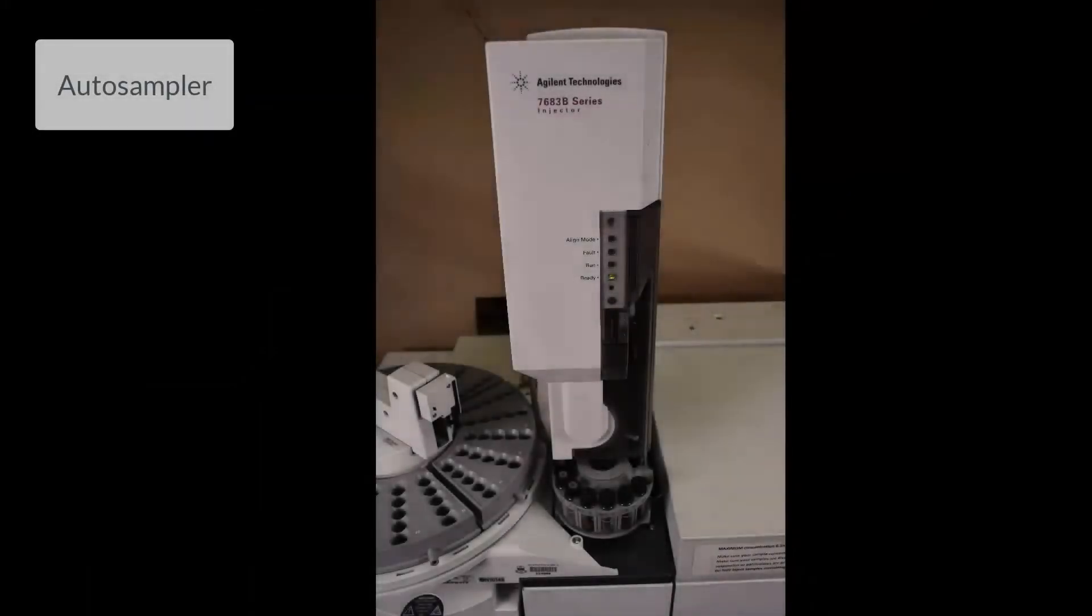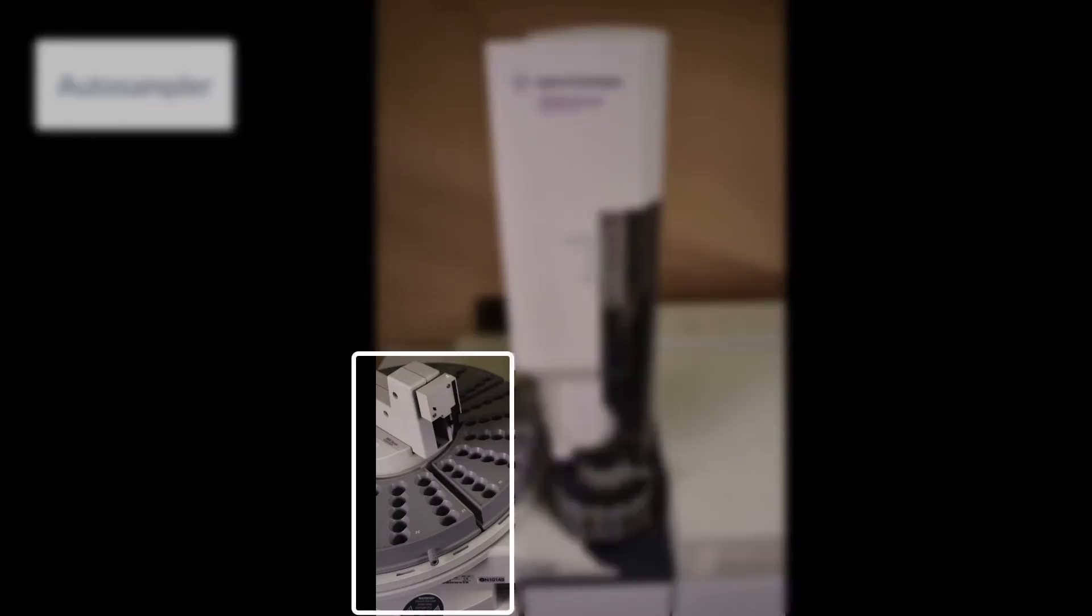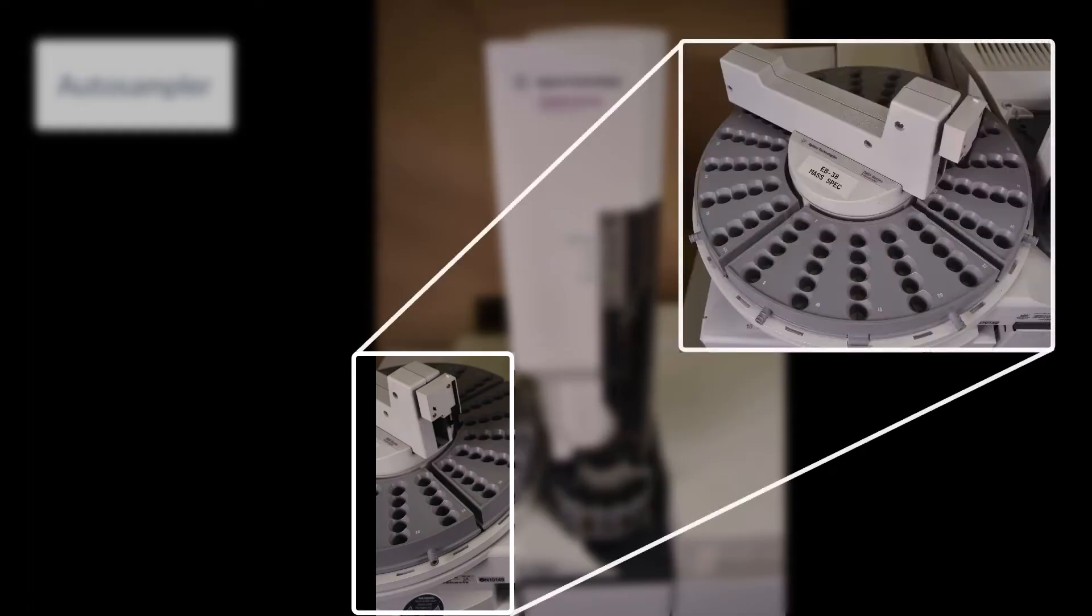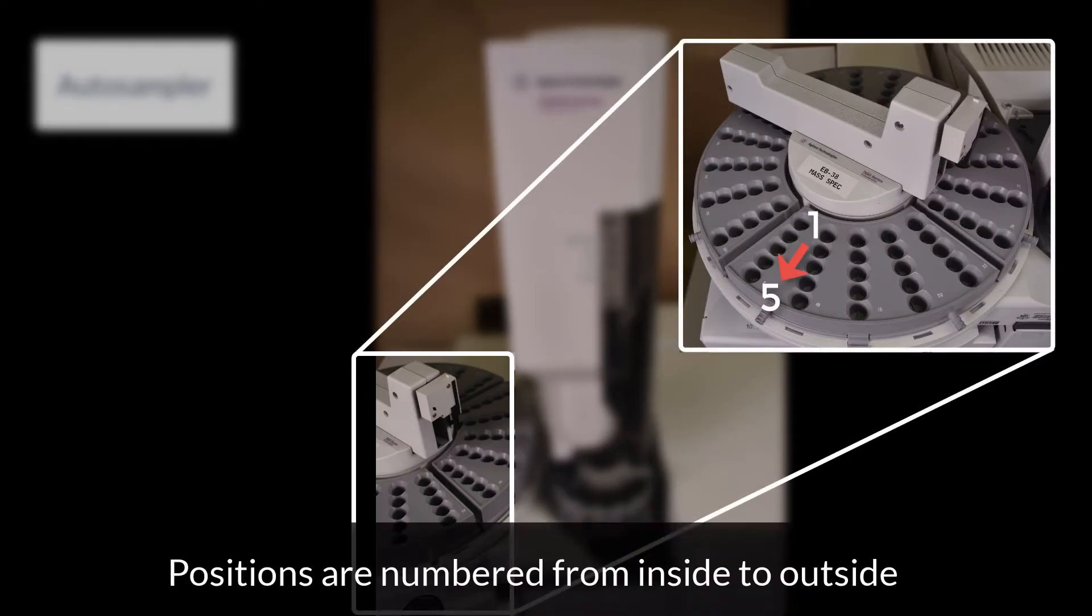The auto-sampler allows for fast sample introduction, as well as multiple injections done by the instrument itself. Here is the sample tray. Note that each position is numbered. Position numbers on the auto-sampler allow us to tell the instrument when and what sample to inject.